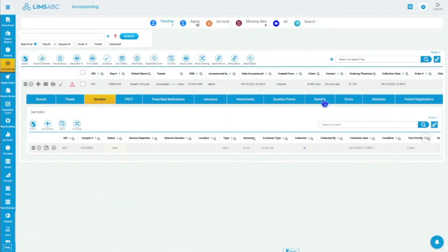So if we turn on the integration with our benefits provider, you can actually see what the patient coverage is, right? So what is their insurance covering, the full coverage right here in Accessioner. So you can choose, hey, they're not covering UTI, you're not going to do it, right? So you have that flexibility here instead of doing the test and finding later that the insurance is not covering. But that's really part of your process and how you handle that. We have the tools here to support it either way.